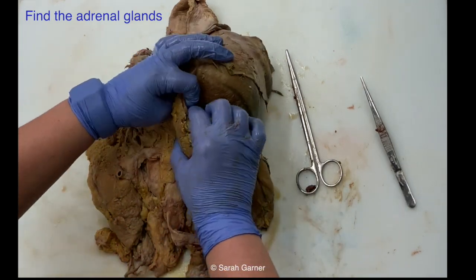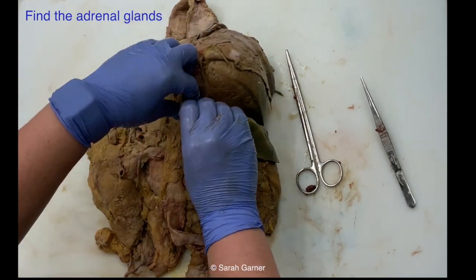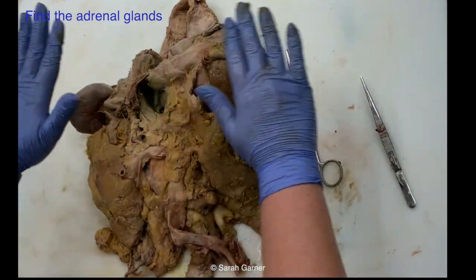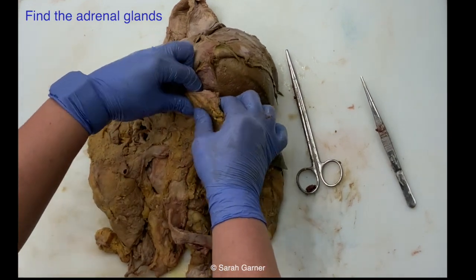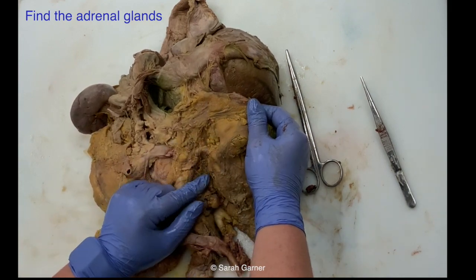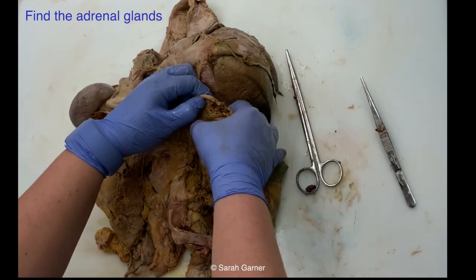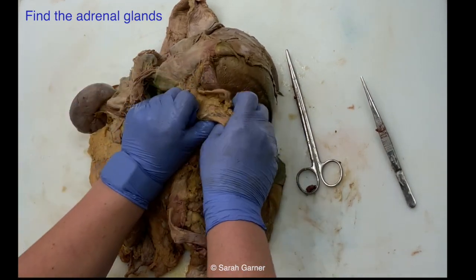And so when you're looking in here, the best thing to do, honestly, in my opinion, is to just feel. And if you're finding that you're looking more than feeling, close your eyes. That probably sounds crazy because there's sharp objects around, so obviously make sure all the sharps are out of the way. But if you're just feeling here, I can feel the difference between this, which is your adrenal gland, and the rest of this, which is fat. Can you tell that from looking at it? No. Once you feel it, then you can peel off the fat around it, whether it's with your fingers or blunt scissors, whatever the case may be, and it's going to come right out at you.